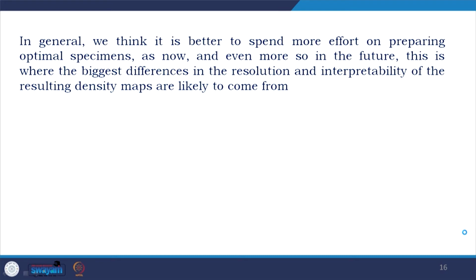In general, we think it is better to spend more effort on preparing optimal specimens, that is, we should put more time on sample preparation, as now and even more so in the future. This is where the biggest difference in the resolution and interpretability of the resulting density maps are likely to come from. If your protein sample is homogeneous and stable, you always have an advantage.